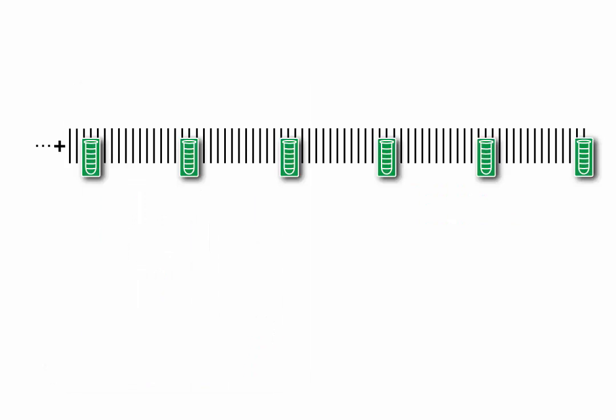Let's return to our hypothetical lab from the previous video. Again, each vertical line represents patient testing. The test tubes represent the QC events. A green test tube indicates that the QCs were accepted. During the testing, an out-of-control condition occurs that affects all subsequent results.